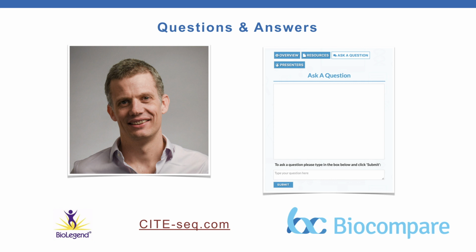All right, Peter, I have, I think, 4 or 5 more questions for you. Sure. How are CITE-seq and hashing antibody-oligo conjugations performed?